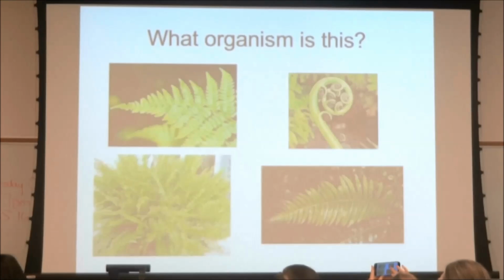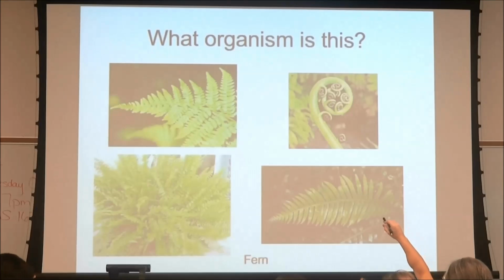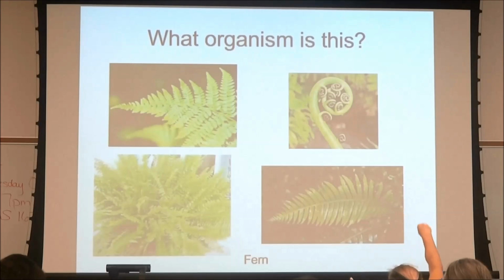Okay. Ferns. Okay. How did we know it was a fern? Okay, what about the leaves? Oh, they have sori on the bottom. Okay, we can't see the sori. But the leaves are branched, right? It's the only plant we looked at that had the branched leaves.